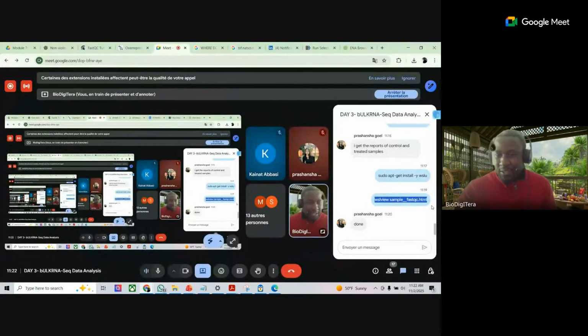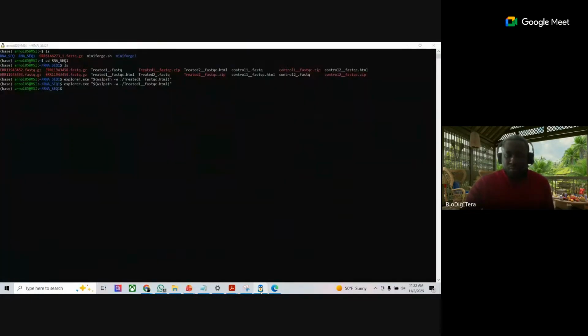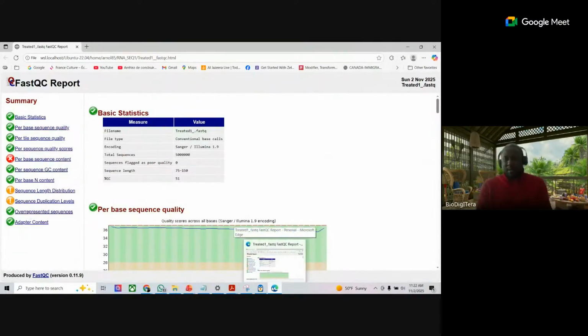Okay, guys, I give you 5 minutes. When you are all done, you just write done in the message area. I give you 5 minutes to make sure everything is fine before we get into the explanation. As a bioinformatician, this is the most important part of today's class. So at 11:30, let's say 11:25, since it is 11:22 now, let me set the timer, guys.